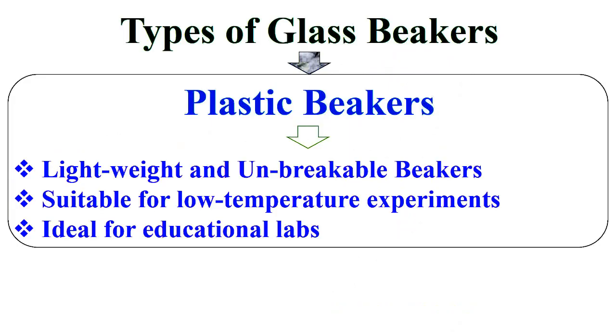Plastic beakers are lightweight and unbreakable, suitable for low-temperature experiments, and ideal for educational labs, as mentioned in the next slide.